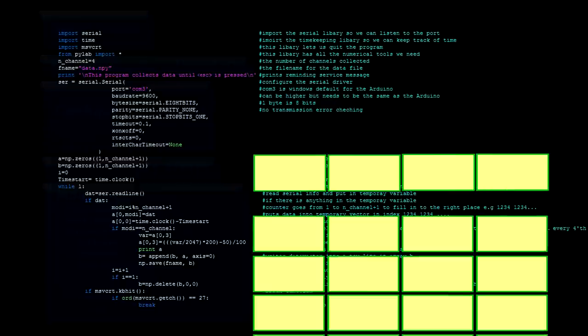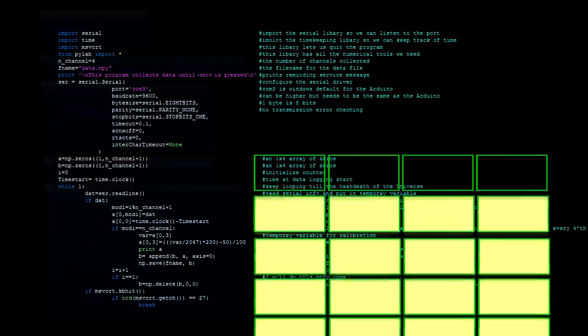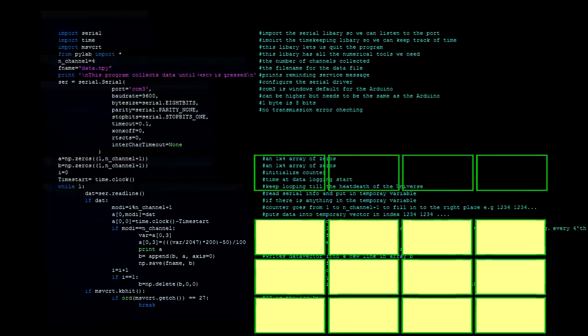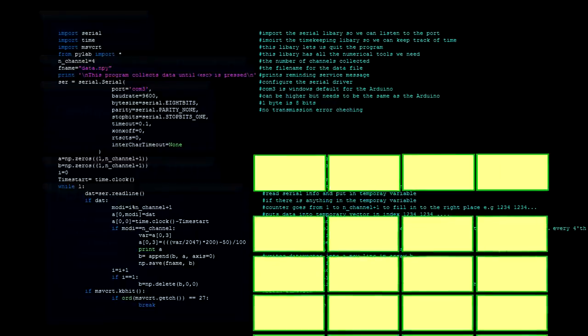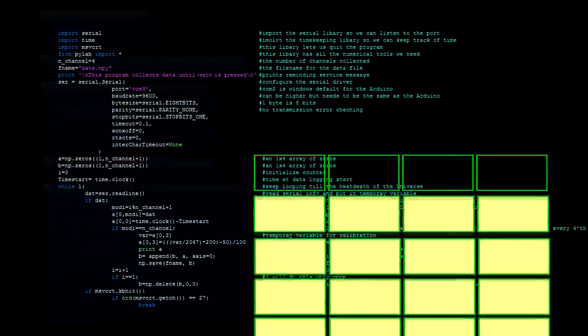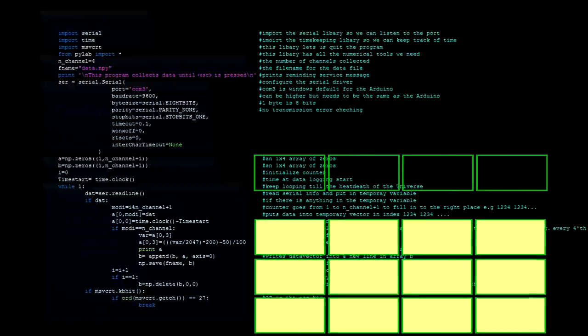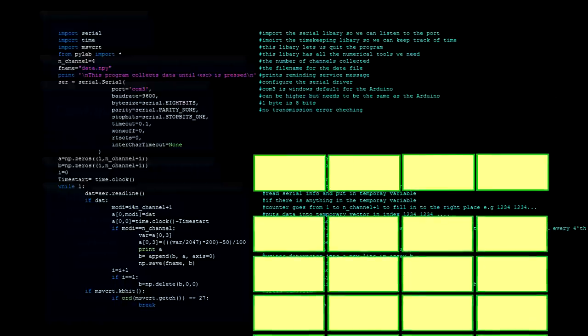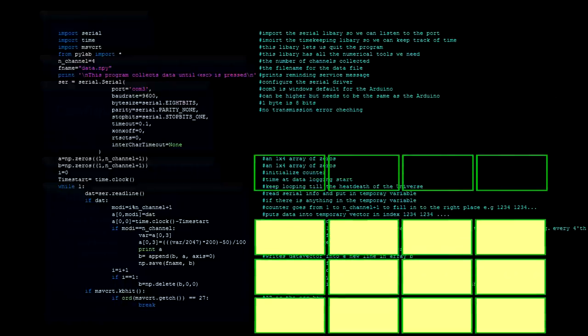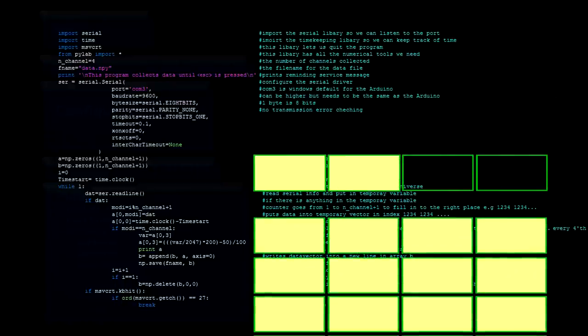So this is a working cycle of the program. We add each value received to a vector. After the vector has collected all the values, we calibrate, print it out, add it to the main array and save the array.